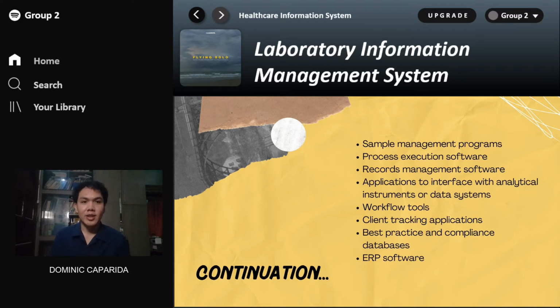This interface is how a system communicates or takes action or collaborates with another system. This will be discussed more later. They apply this interface with analytical instruments or data systems. This involves a lot of systematic process. Data systems, for example, the interface of a clinical instrument and a information system. It will be discussed a lot more later.